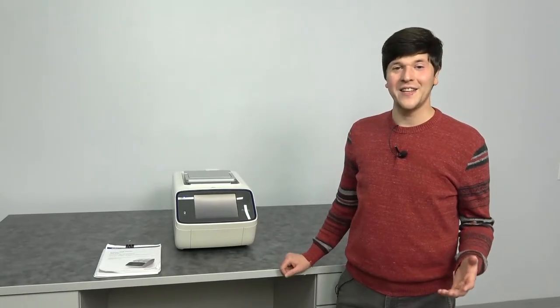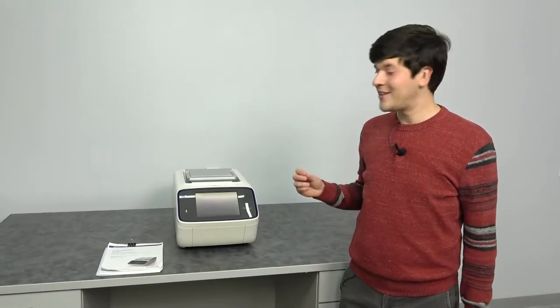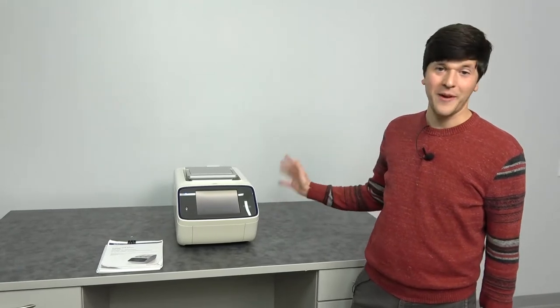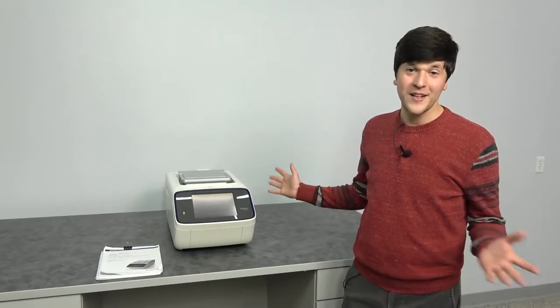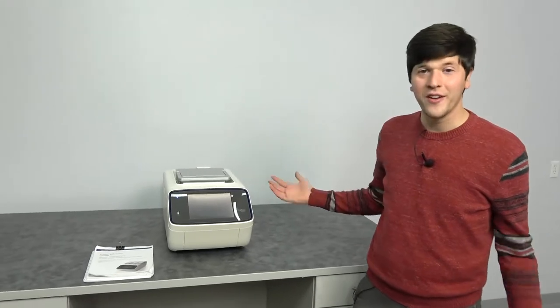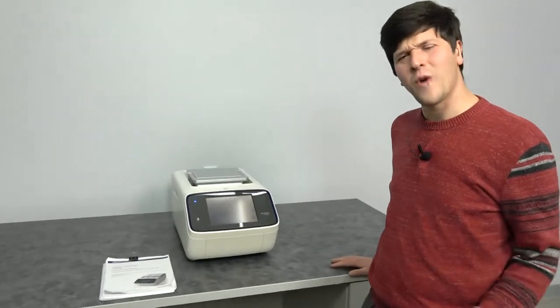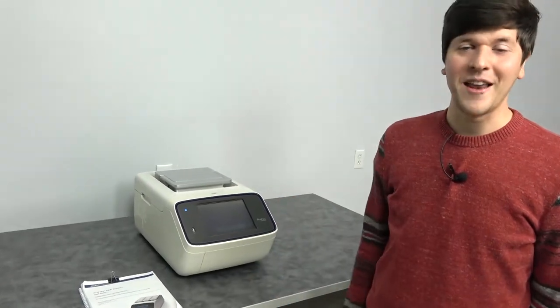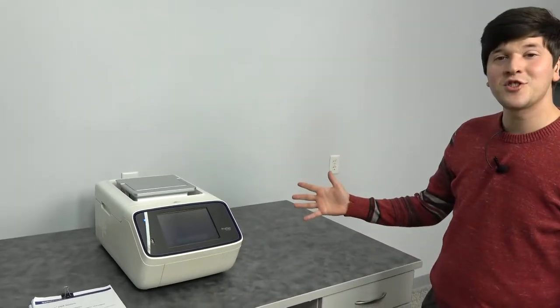This is Nathan from New Life Scientific, and today we're going to talk about a 2016 Applied Biosystems ProFlex Thermal Cycler that we have in stock. This thing's only three years old. It has less than 1,200 cycles on it, though we can explore that today in the menu if you'd like to see it. It's a good-looking instrument.